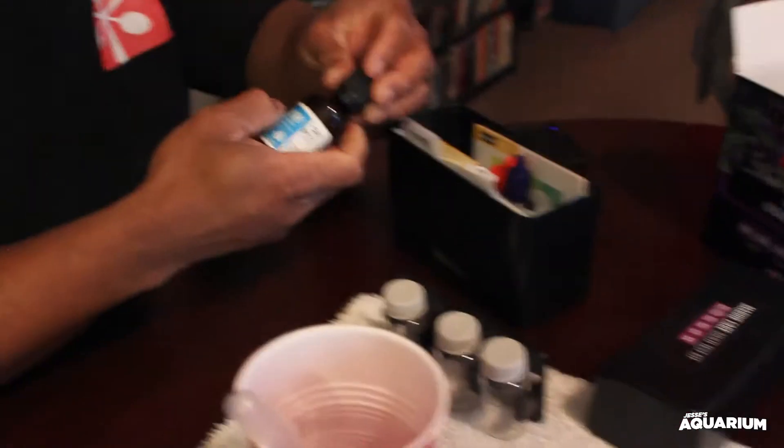Let's see what happens — one, two, three drops. I like it; it didn't really want to come out of there, but it let it come out. It says after we add that, shake it for 10 seconds.